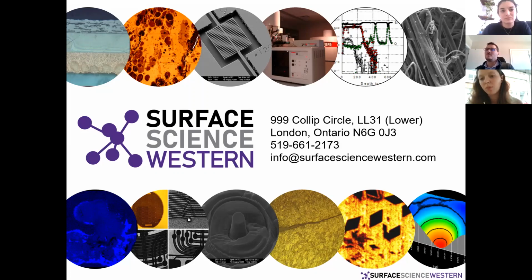There are some detection limits that you've got to factor in before you really start saying, okay, yeah, I've got chromium-6. We're doing some work on that right now in the cosmetics industry. Sorry, the tanning industry; cosmetics is nickel. The tanning industry is chromium. When you get a piece of leather that's been tanned with chromium products, is there chromium-6 remaining on that, or is it okay that it's just chromium-3 remaining? And so we try and quantify how much chromium is present.